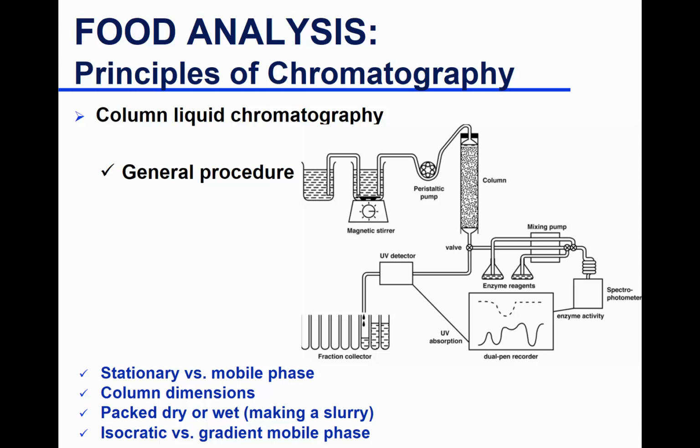And then the tray starts moving and fills in your fractions. And then it moves to fill another tube and so on. You can take each fraction and you either do more analysis, or if you're collecting a certain type of protein to do a certain type of analysis, you can freeze dry it and then run analysis on it.